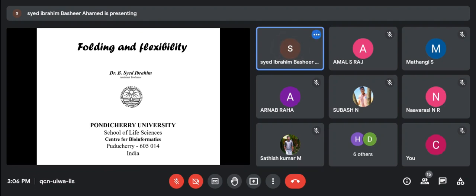All right. So today we are going to see about this protein folding problem. The first experiment is the denaturation experiment. I don't know how many of you have the syllabus with you right now. In learning the protein folding problem, the first experiment, you are going to denature and renature the protein, and then do a UV study of the denatured protein. That's what we are going to see today.